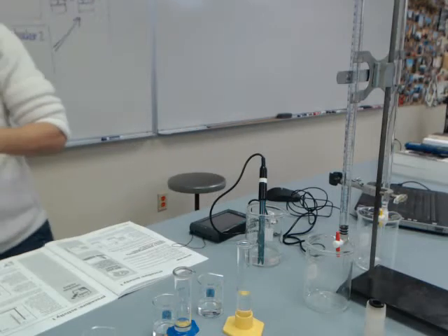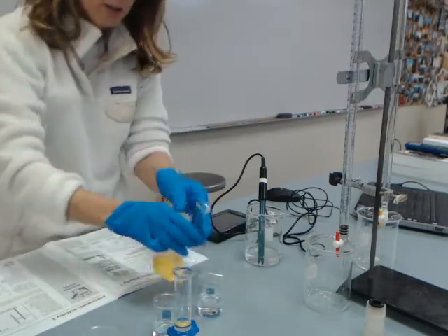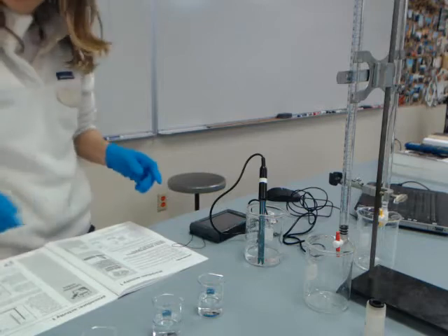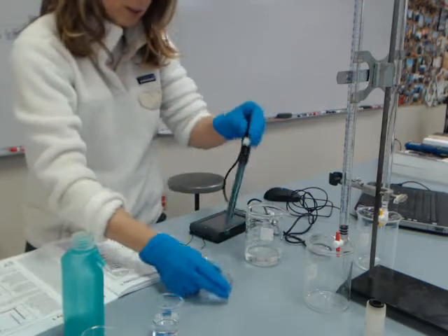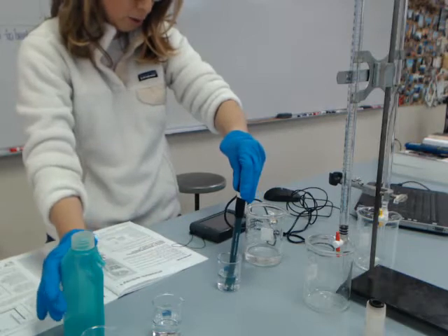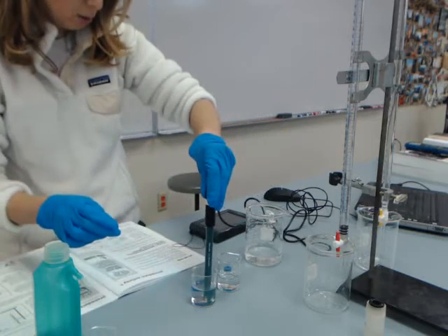Now I'm going to dilute the buffers with my 15 milliliters of deionized water. I should record the pH now because I didn't record it — I recorded the pH before I had diluted it with some water. The pH is now 4.90 for beaker number one, and for beaker number two the pH is also 4.90.